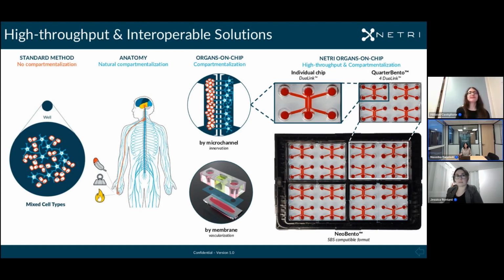And so during the culture, you will have neuronal endings, axons, that will grow and pass through the microchannels, and then innervate your target organ or target cell. And that way, compared to cultures in wells, you do have a compartmentalization where your target cells will be in contact only with nervous endings, and your somas will stay in a separate compartment.